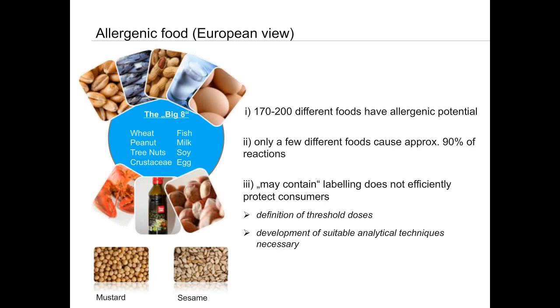So we do not want to detect species, hazelnut or peanut. We want to directly detect the eliciting agent, the allergenic protein, and therefore we focus only on these proteins. And in addition, we want to be able to distinguish specific food allergens from different species.